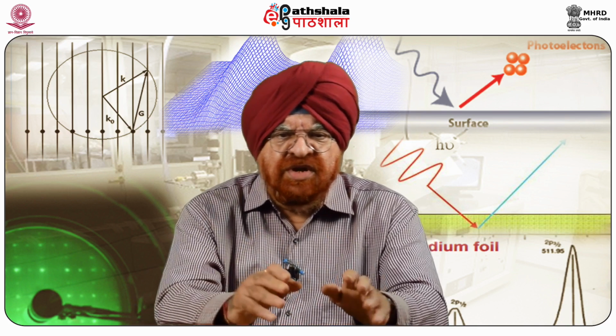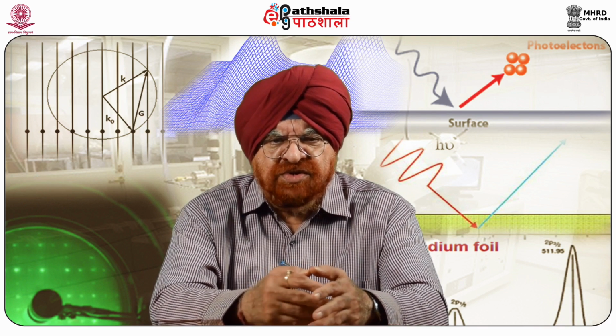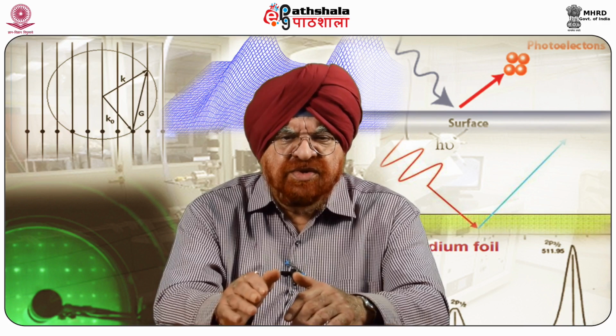An electron energy analyzer produces an energy spectrum of intensity, number of photo-ejected electrons versus binding energy, the energy the electrons had before they left the atom. Each characteristic energy peak on the spectrum corresponds to a specific element.